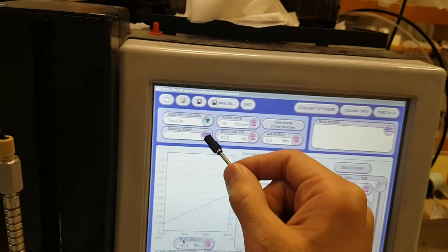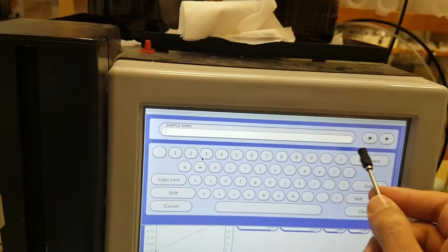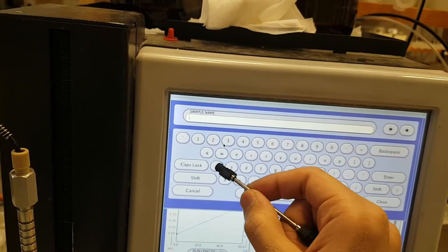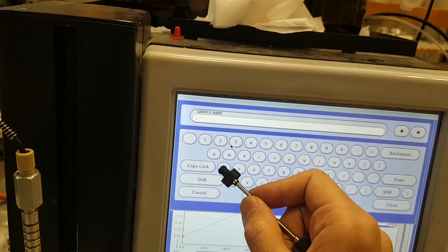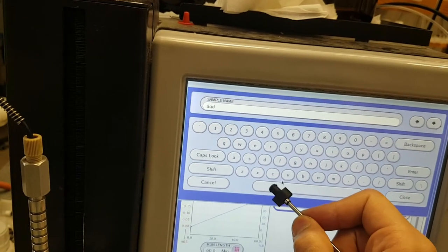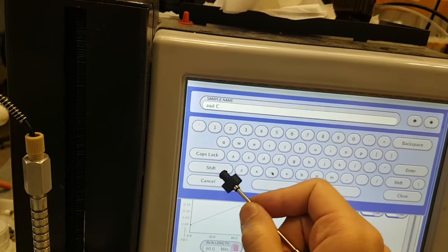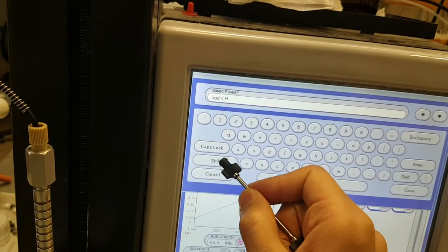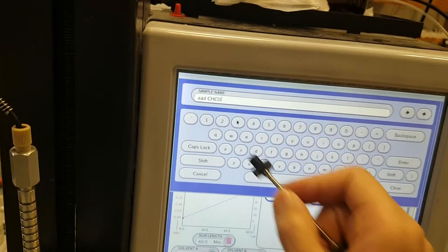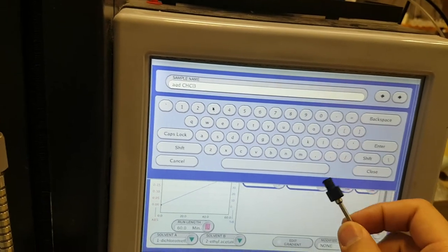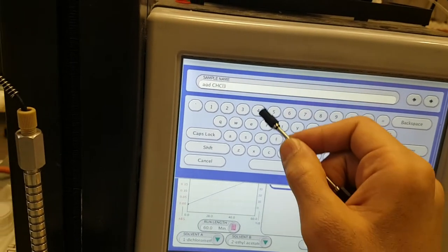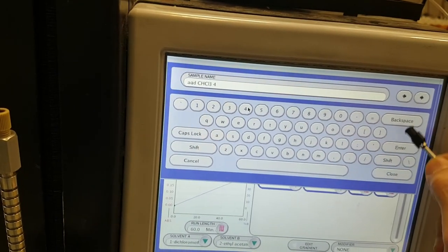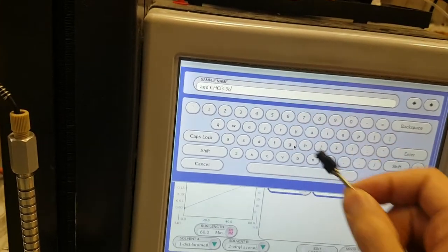You need to write your sample name. This is the chloroform extract. I have just three grams.